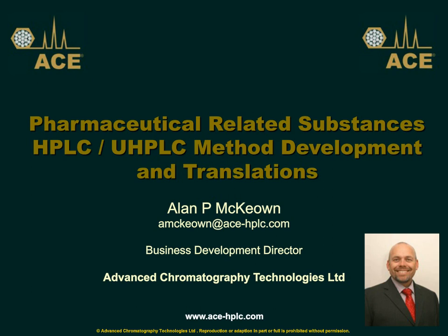Excellent. Thanks, Alan. What software was used to optimize temperature and gradient conditions in the method development for paracetamol? So there are various softwares available. In the example that I showed, I think the screenshots were taken from DryLab or LC Simulator. I can't remember which one it was. They both gave similar results, but I think it was either LC Simulator or DryLab. I can't remember now.